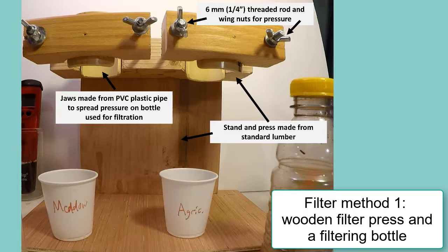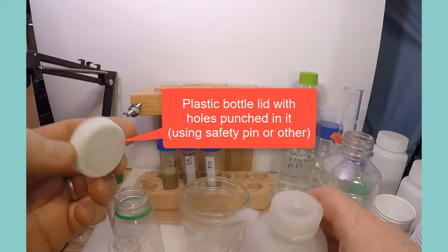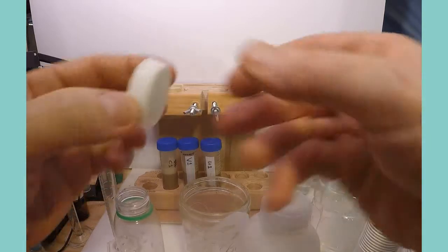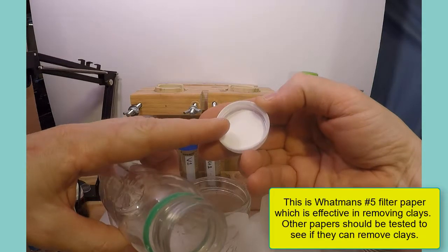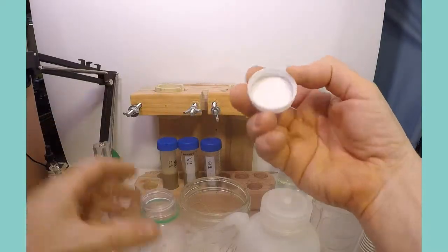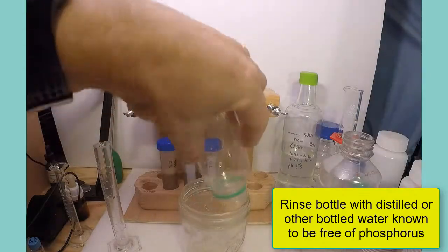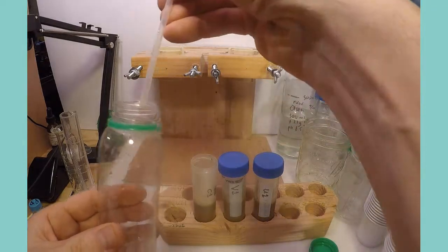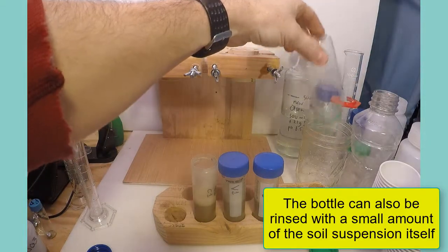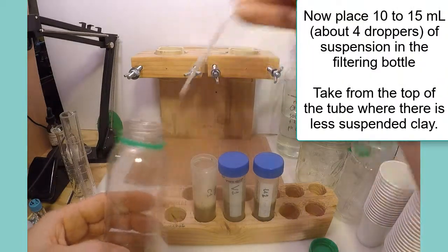This picture shows a simple filter press that can be built to allow quicker filtering of the soil extracts. To use the filter bottle, a circle of filter paper is cut to fit inside the lid of the bottle; the lid also has small holes punched or drilled into it. Between 10 and 15 milliliters of soil suspension are placed in the filter bottle and then pressed so that filtered solution is pushed through.